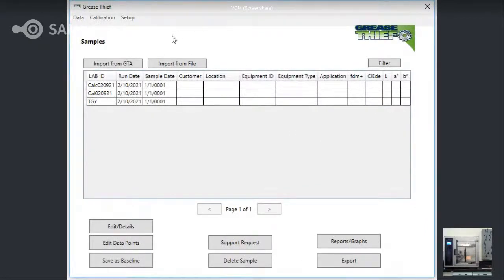So after the run, and on here we can see, I didn't show this before, I can show it now, I did forget, I got a little nervous when I started. The load cell is used for calibration. You can see this here. This would get loaded just like a grease thief sample. If you see in the middle, it's got that same sized opening. It'll get held by the holder inside. This gets compressed, and we're measuring the slope of the force graph to make sure that it reads correctly, and that's how we're calibrating our instrument.